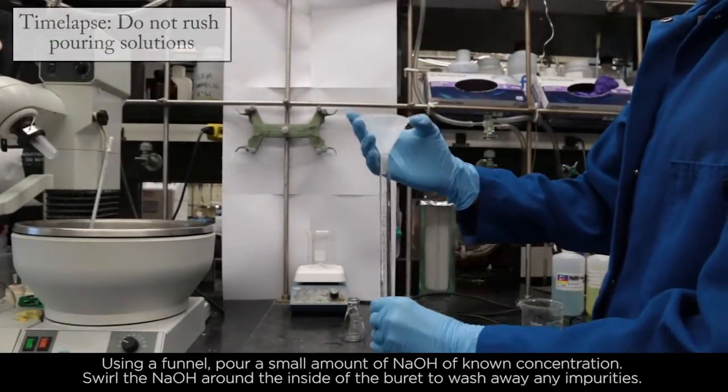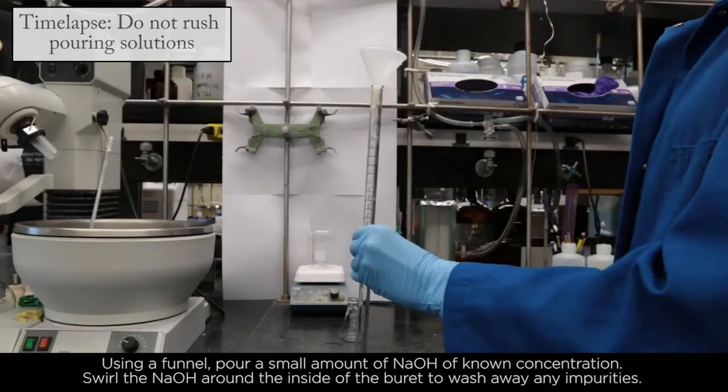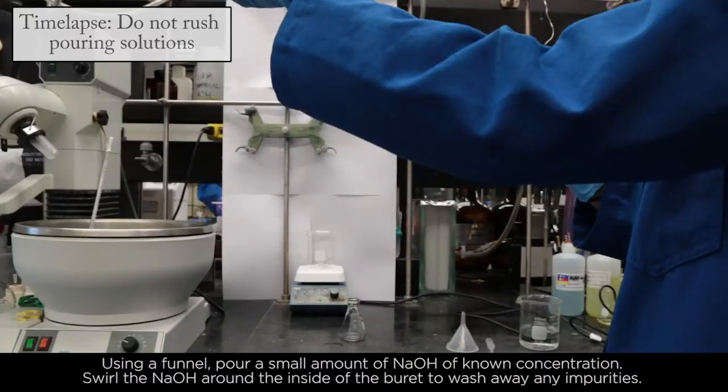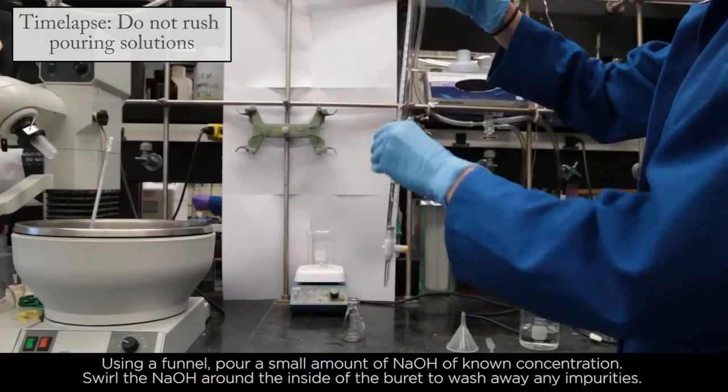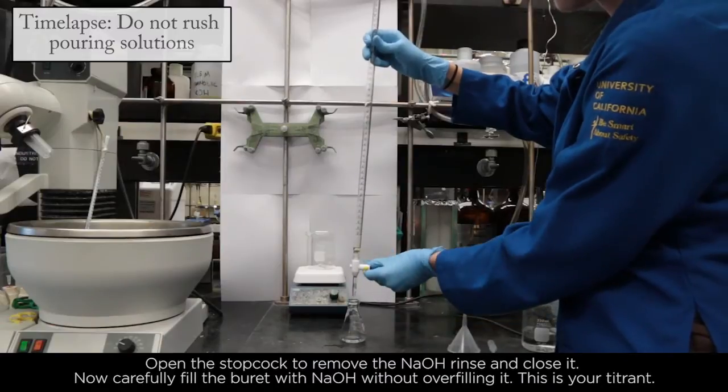Using a funnel, pour a small amount of NaOH of known concentration. Swirl the NaOH around the inside of the burette to wash away any impurities. Open the stopcock to remove the NaOH rinse and close it.